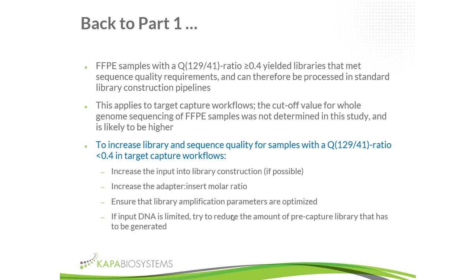So typically people aim to make a microgram or 2 micrograms of DNA, and sometimes that's what you need. If you're going to do single captures, for instance, you need a microgram of each library, and there's sometimes not more you can do. But for instance, if you're doing multiplex capture and you're multiplexing 8 or 12 or 16 samples together, you end up needing very little of each library, somewhere in the range of 100 to 200 nanograms.